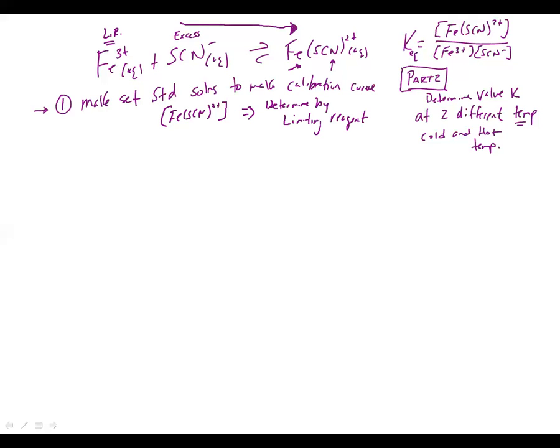So the first part of this experiment, the equilibrium part, was set up in such a way that the iron was the limiting reagent. If you know how much iron you started with, which you will know from the table, you can figure out how much product you would make. That's very specific to the part of the experiment where you're making your standard graph. Any questions on that?